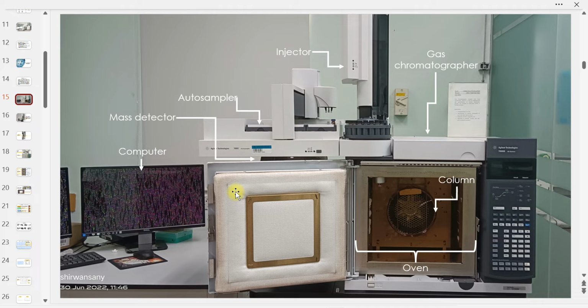You kena ingat bila equipment ni kita purchase, dia buat daripada US, Canada. So dia tak sama dengan condition kita lah. So because of that, yang tu terbalik. Kita pernah run fatty acid yang saya akan pakai dalam our workshop, the one that we are going to do using our workshop. We run 37 compound. We also run ada GCMS yang tadi, the same GCMS. This one GC TOF, GC TOF ni boleh detect 11 je. Yang GC tadi boleh detect 37 semua. Yang tu yang kita very unsatisfied, dissatisfied, kita call. Saya even email di Leco daripada US, saya complain buat this one. Tapi dia tak boleh nak solve.